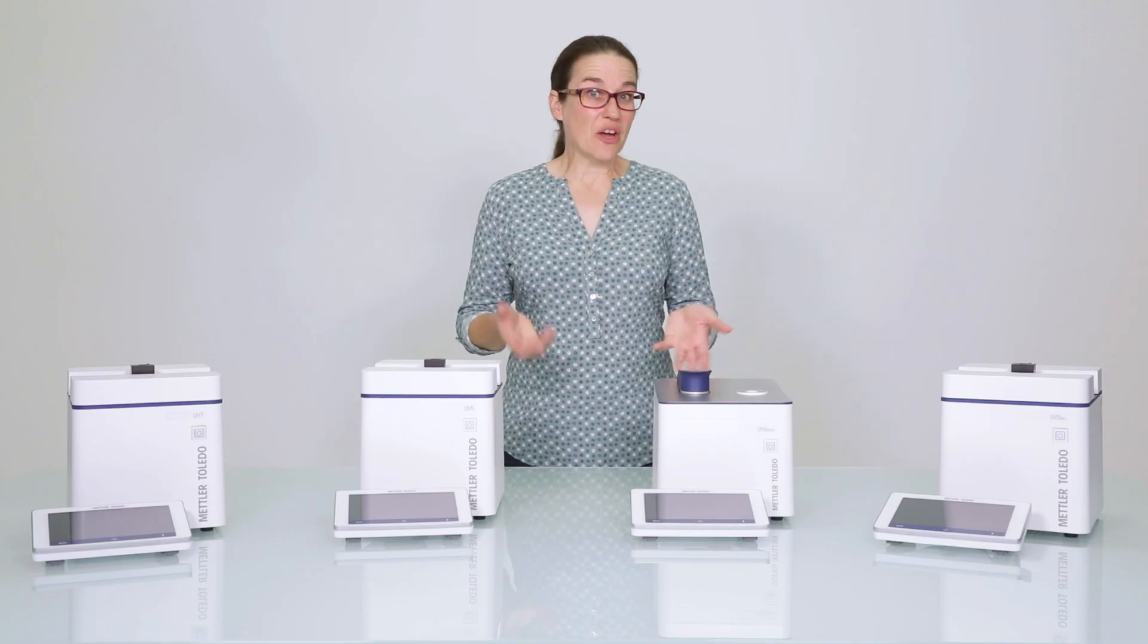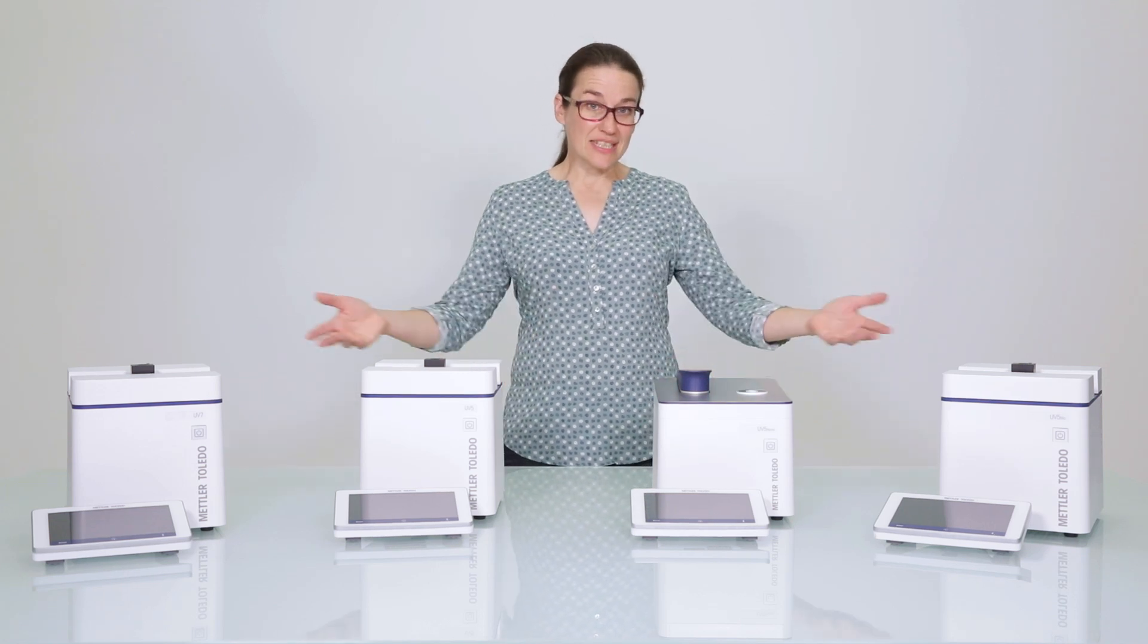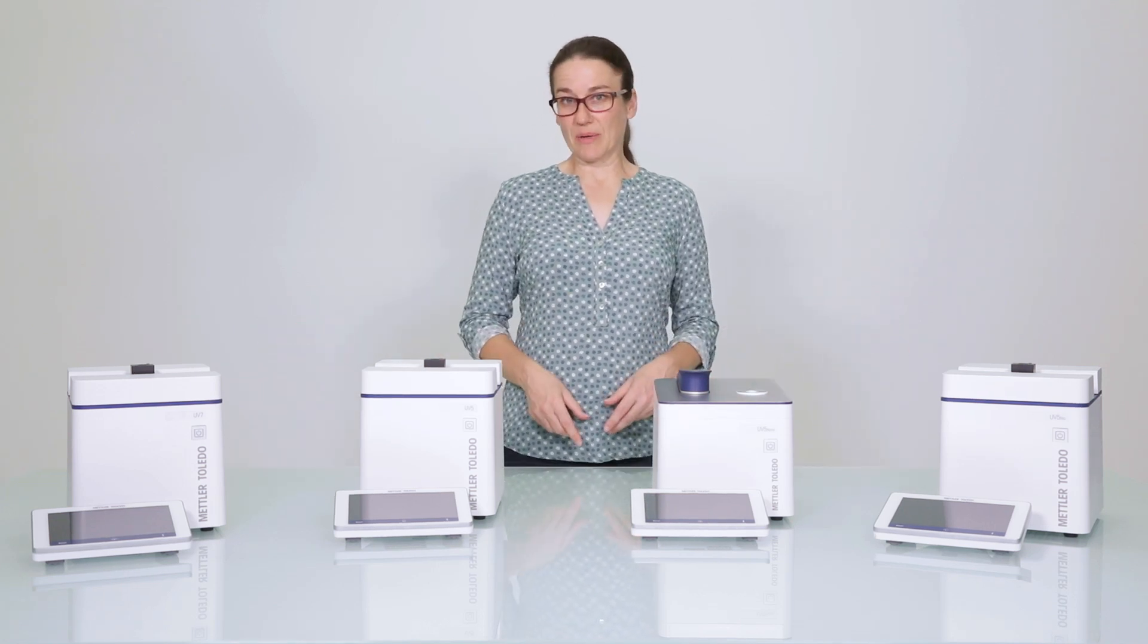Now you know how to use one, let's have a look at the Mettler Toledo range of UV-Vis spectrophotometers.